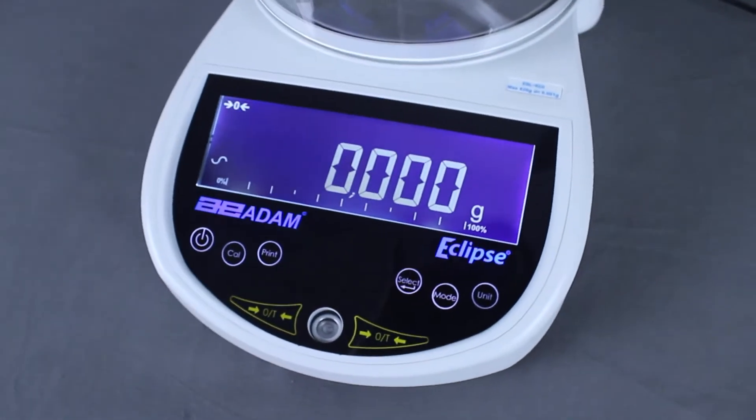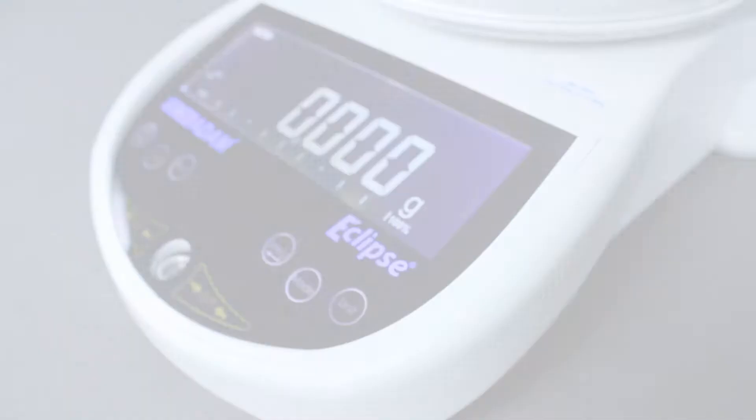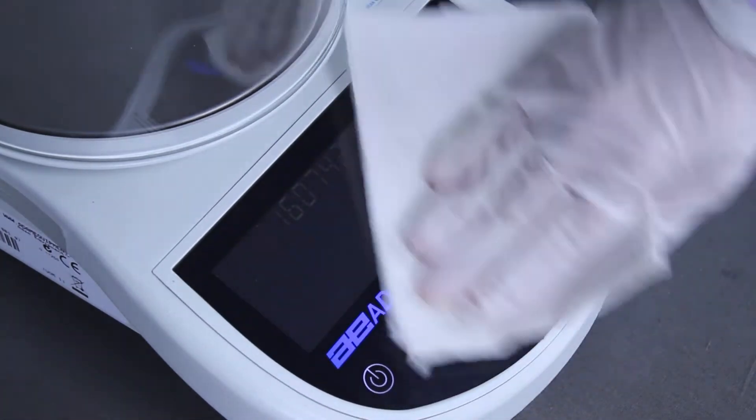The Eclipse boasts a clever design and compact footprint, occupying minimal space on the bench. The keypad's smooth surface allows fingerprints to be wiped off easily.